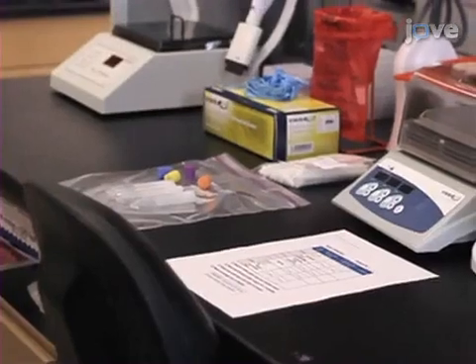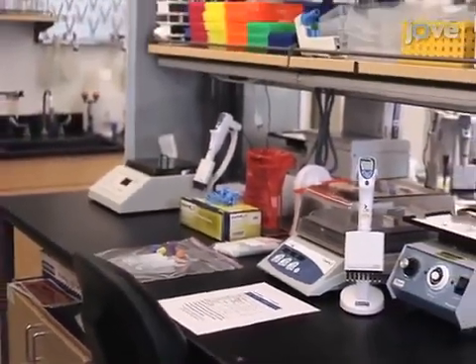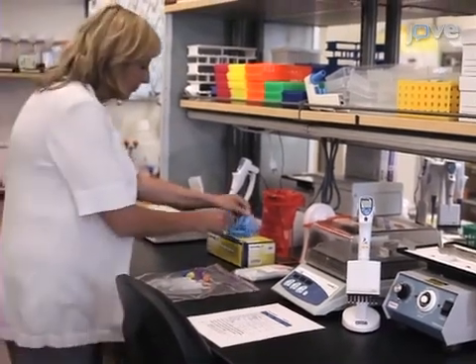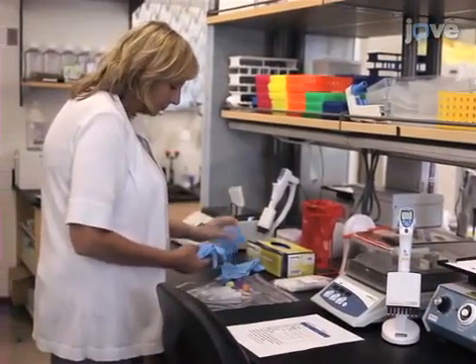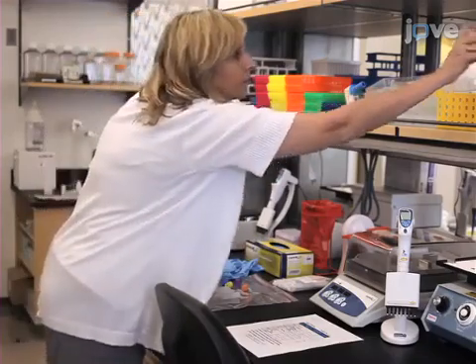Prior to scheduling a home visit to consented participants, gather and assemble the necessary supplies, which includes four Salimetrics children's swabs, four swab storage tubes, four color-coded tube caps, five white labels, one plastic Ziploc bag, a saliva collection instruction sheet, five nitrile gloves, and a storage box.